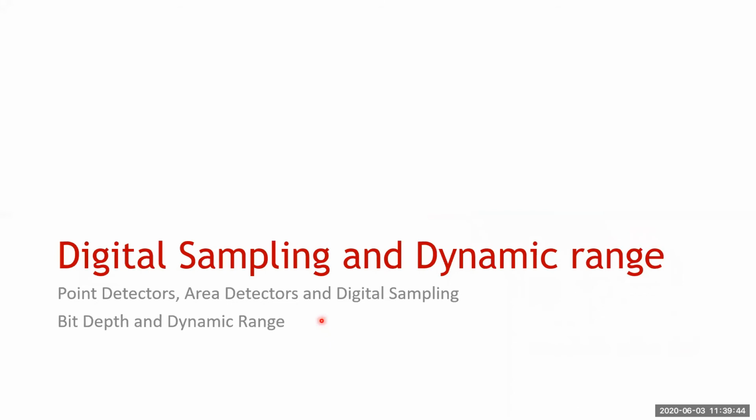So, digital sampling and dynamic range. Again, another concept that people really don't understand too well and don't really think about when they sit at the microscope, which is a shame, because it really hampers you if you don't do this properly or don't think about this when you go off and do really high level data and image analysis. Because everything is there for you on the microscope, and it's just there for you to know what to do. So I'll talk about different types of detectors and the digital sampling, and then I'll talk about the dynamic range and bit depth.